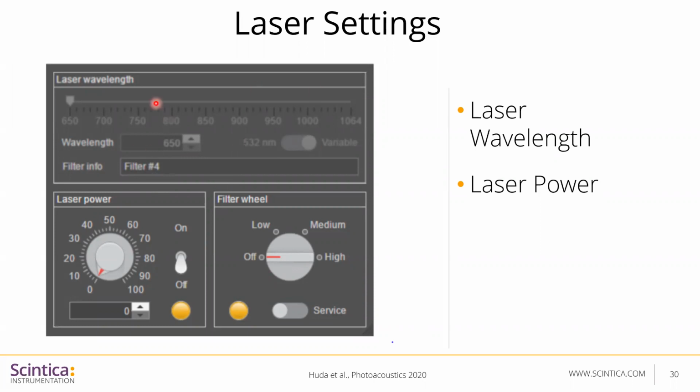The second part of the laser setting is the laser power. The value that changes the laser power output is the active laser output. A value of 100 will have maximum energy output, and a value of 0 will have no output. The laser power number is based on lengthening to shortening the Q switch delay.